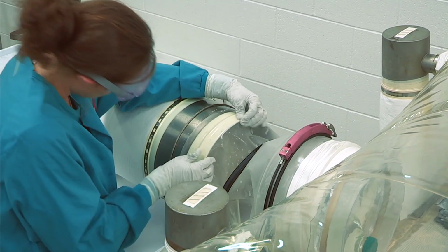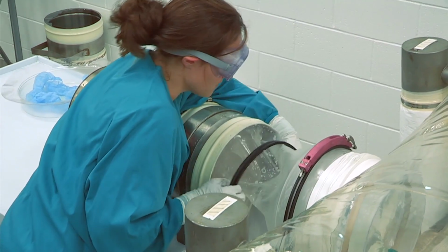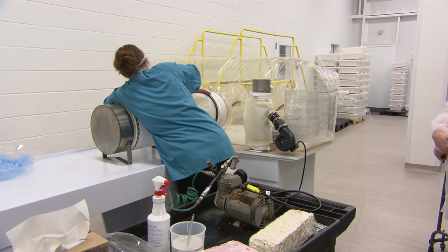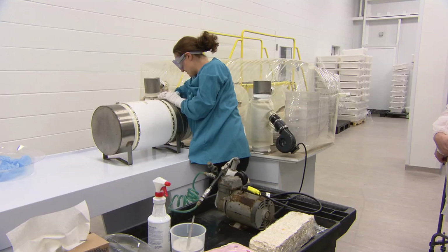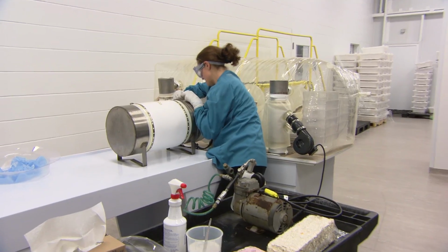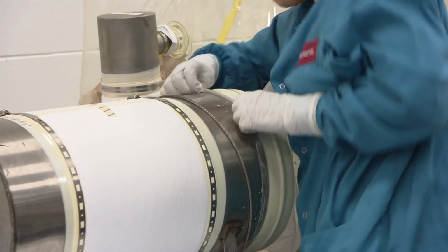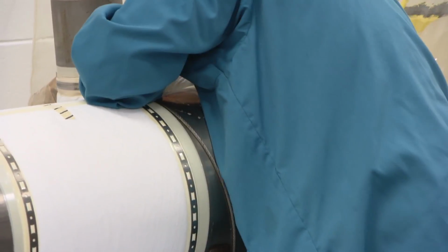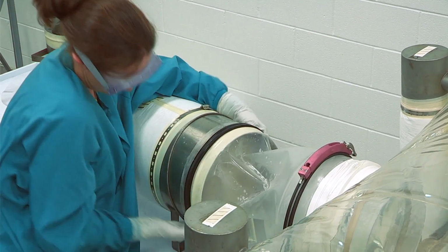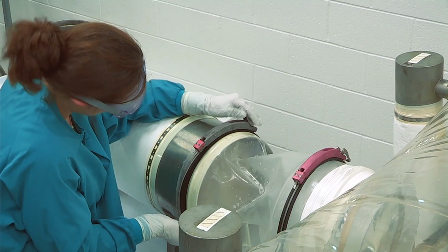I try to make sure that our sleeve is pulled on beyond the end of our tape here. And you want to make sure there's a seam over on this other side here. You want to make sure that that's lined up as best as possible. So you don't want to have any twists in your sleeve. It just makes it easier to get your supplies in and out. Pull on our band and put our clamp into place.